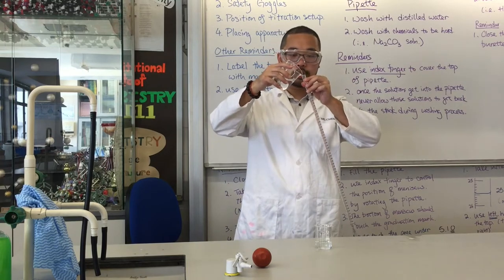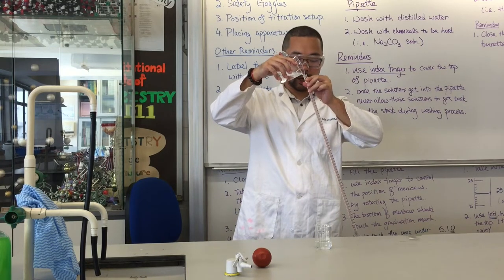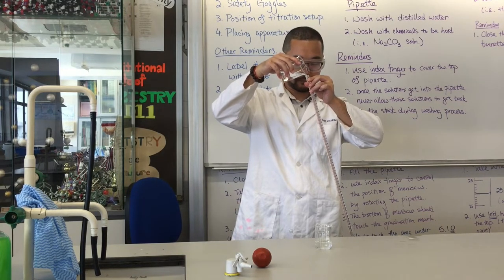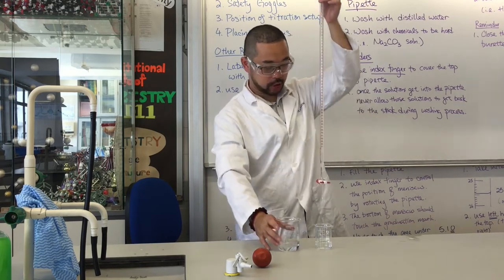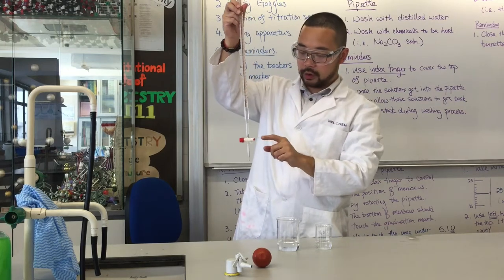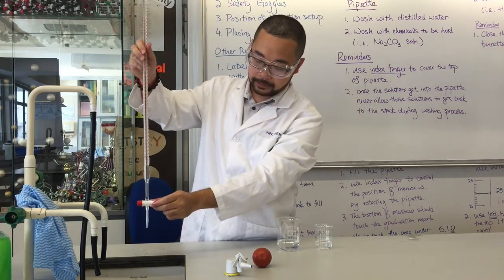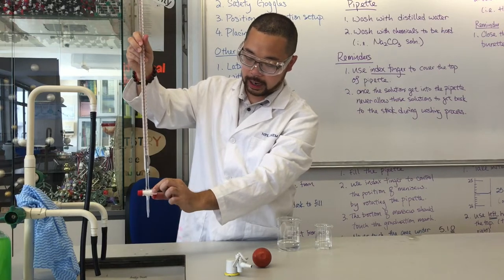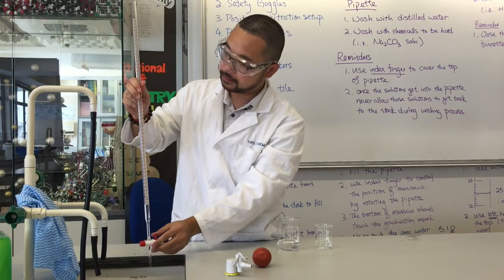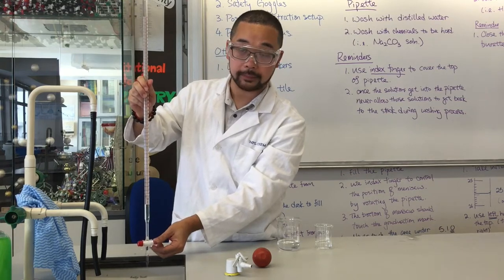Now we pour the nitric acid into it. Again, half filled will be good enough. First, we have to rinse the jet. So open it near the sink, the liquid will flow out, then shake it a little bit, and close it again.